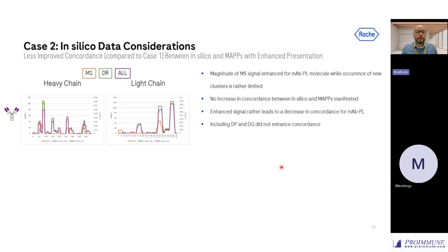If we now look at the in silico data, and here it gets a little bit wild, in this situation we were precipitating all HLAs, so DR, DP, and DQ. So there was a pan precipitation, and that's what we looked at now, whether that impacts the data. And to start with, again, similar diagrams for the spectrum of presentation on a linear scale.